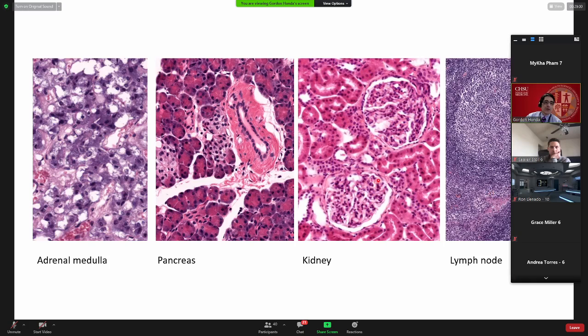You mentioned the kidney, you talked about glomeruli, Bowman's capsule, tubules, et cetera. And so I think a reasonable first-year medical student would say, yeah, that's kidney. That's what I remember kidney looks like. Pancreas, remember, if you get the right section, you have islets of Langerhans. They're lighter, they're round. The rest are these little acinar structures, and you have a duct. And then the adrenal medulla, we just talked about briefly at the very beginning.